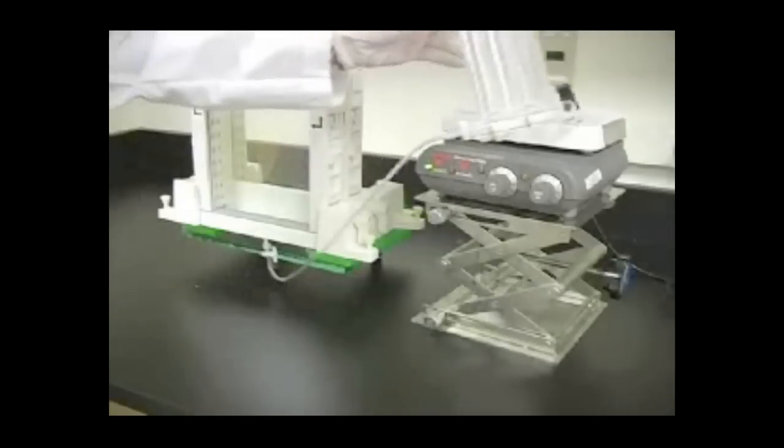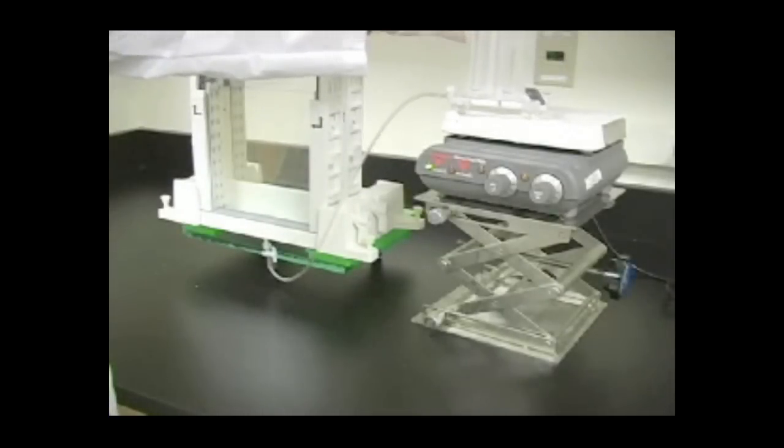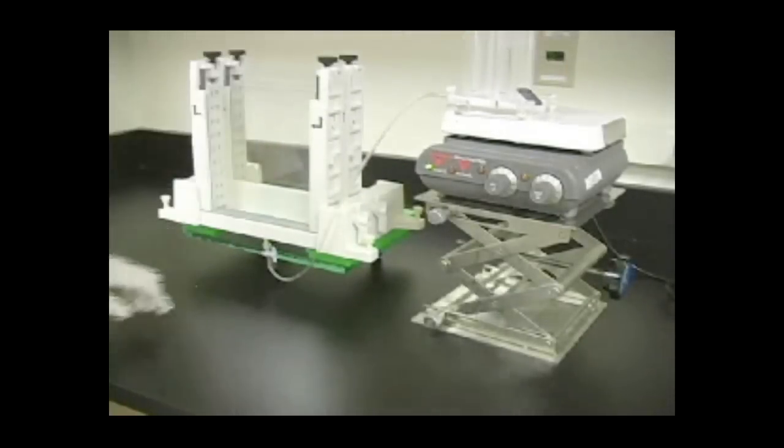Place the gradient former on a stir plate that sits on a raised platform so that the former is above the top of the gel sandwich. This creates a hydrostatic head large enough to pour the gels within 10 minutes from the time the initiators are added to the light solution.